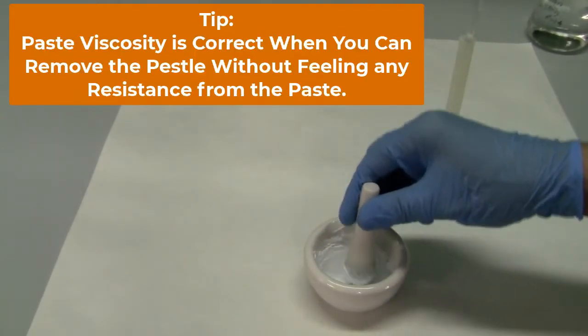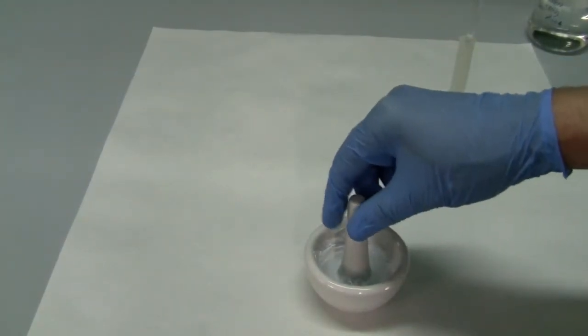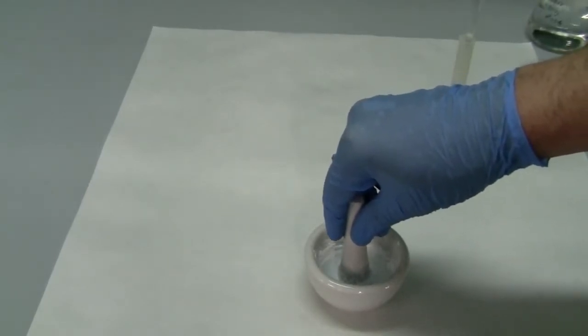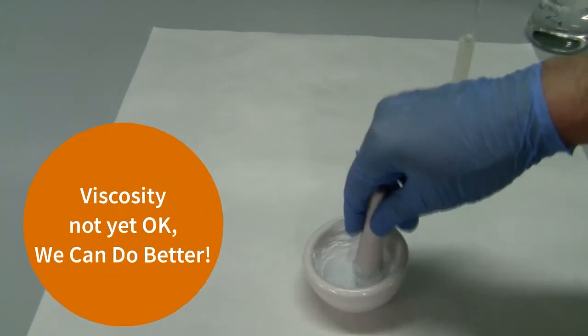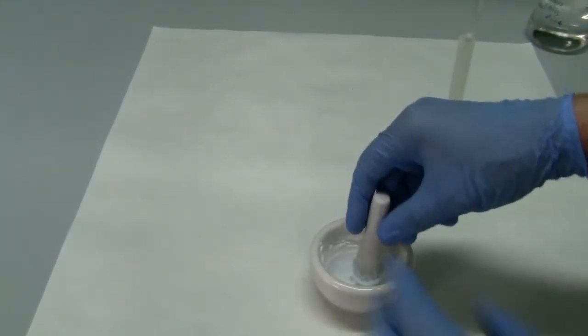To check the consistency of the paste, it is better to put the pestle onto the mortar and to try to lift up. You should not notice any movement of the mortar when you raise up the pestle, like in these images.